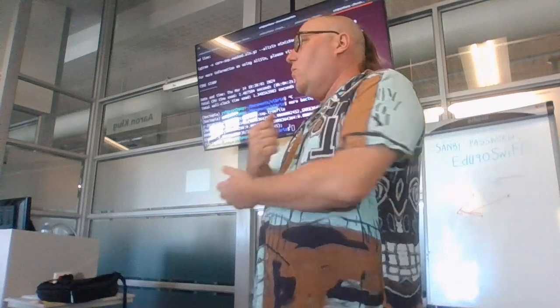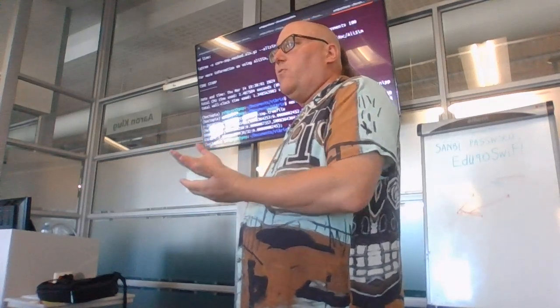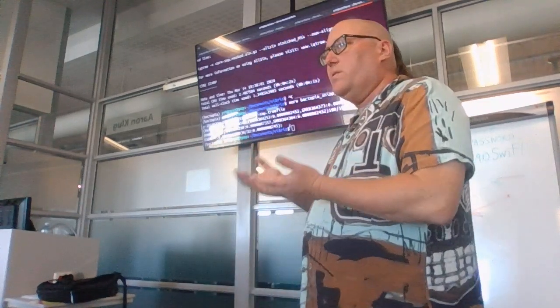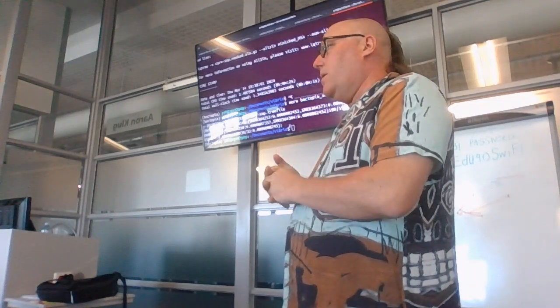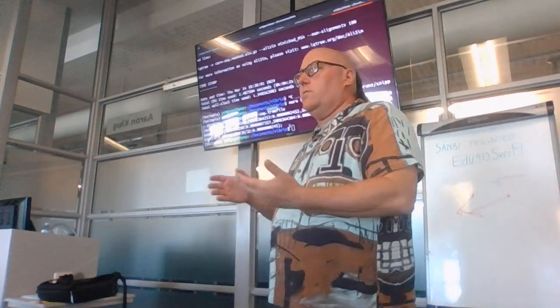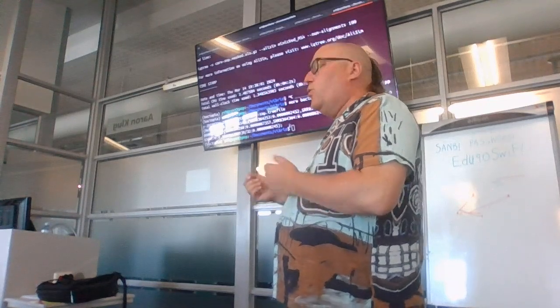Why am I doing a sequencing run and getting a 50 megabyte file out of my sequencer, or nothing? Those are the kind of things I'm seeing from people, in both Nanopore and Illumina. And the other thing I'm seeing is, why is 30% of my Mycobacterium tuberculosis sample human reads?